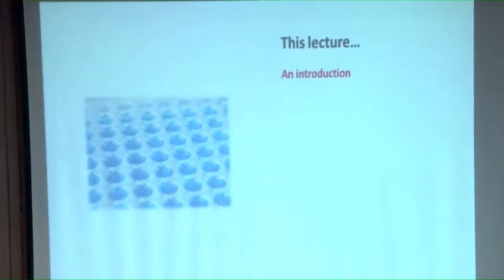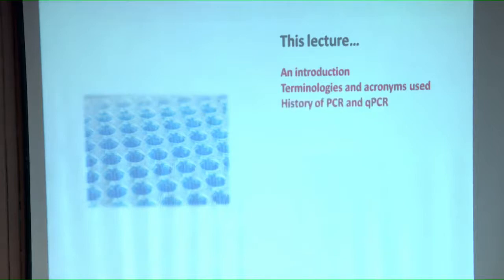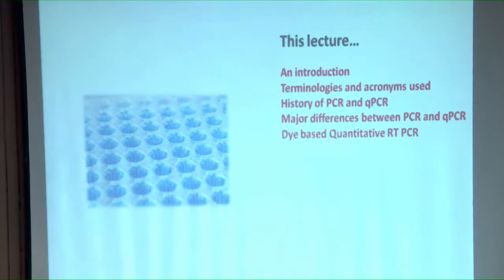This lecture has certain elements I would like to tell you. I would like to give a brief introduction about PCR and qPCR and the history associated with that. And we have the terminologies and acronyms used, which I already told in the previous slide. And we have a history of PCR and qPCR. It's very, very important for us to know. And the major differences between PCR and qPCR, and of course, different variants of qPCR that are there nowadays.